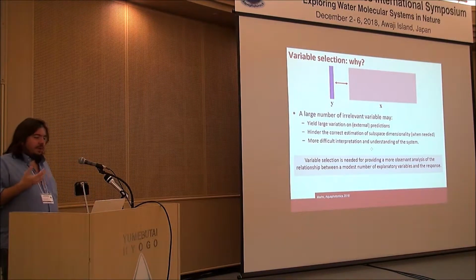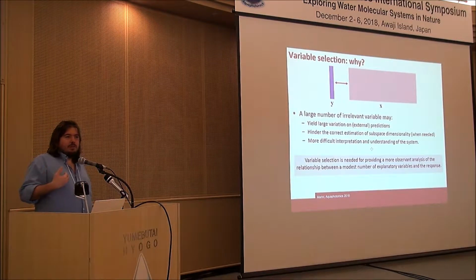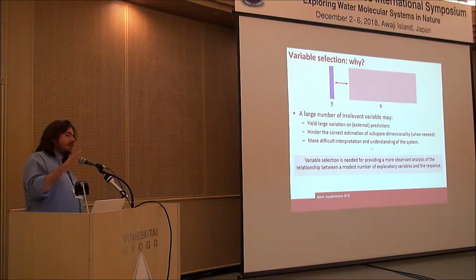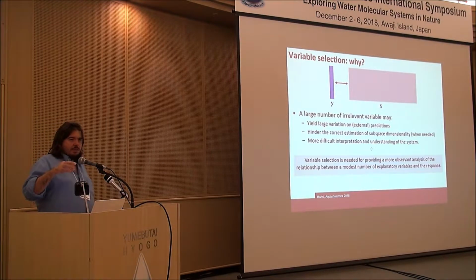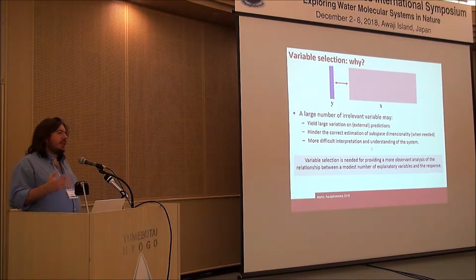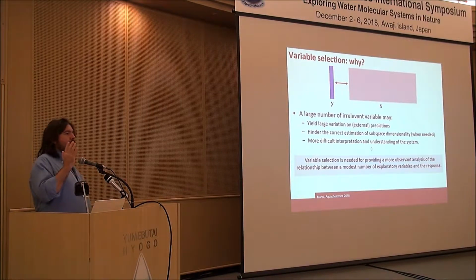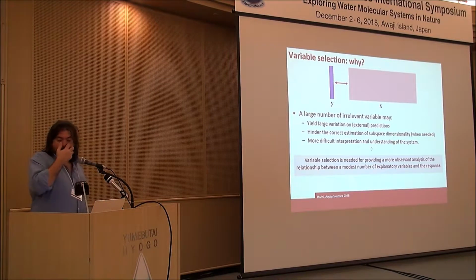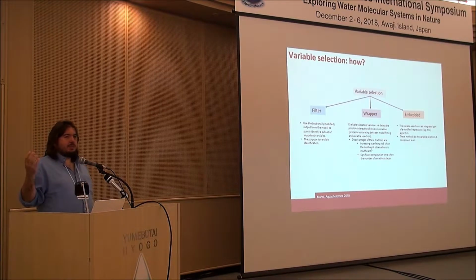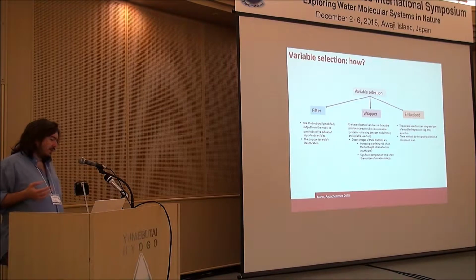It must be said very honestly that variable selection techniques are mostly sold as a way of improving predictions, but in reality, if proper validation is made and if you consider confidence intervals of prediction, it's quite rare that you improve the prediction of models. But the truth is that you may improve the interpretation of models. And in this we have the advantage that we have a lot of models and methods that we can use for variable selection in the domain of regression and classification.